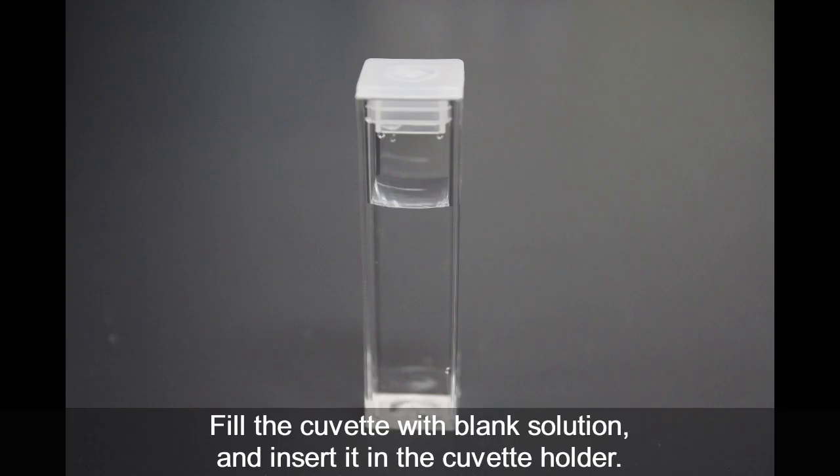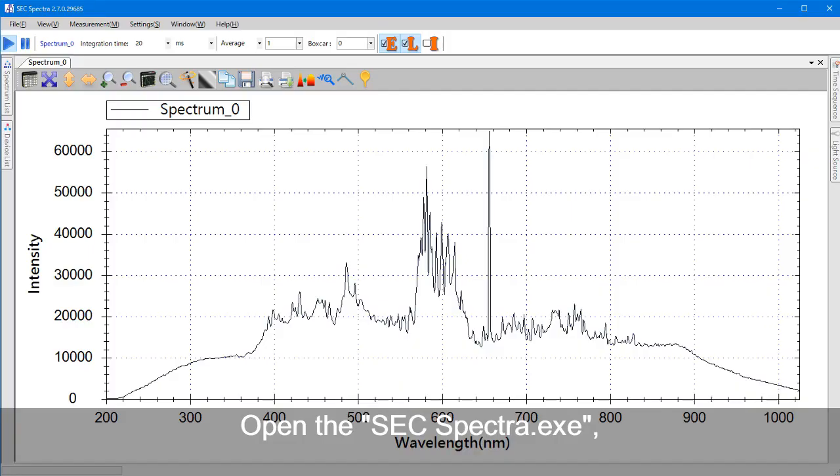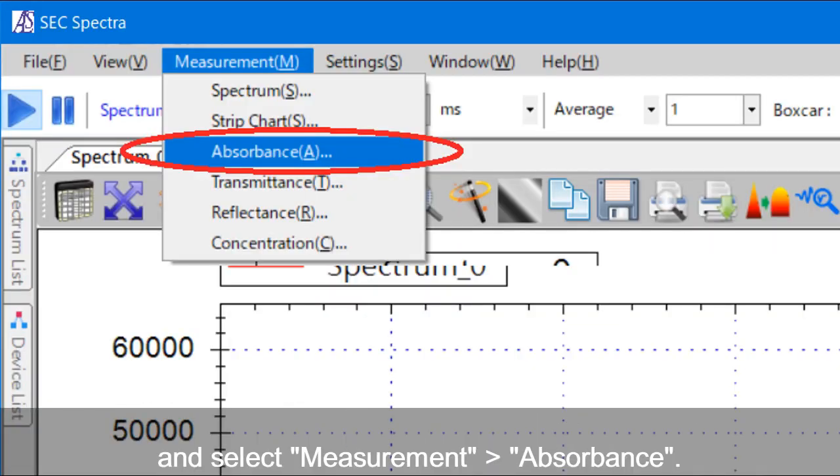Fill the cuvette with blank solution and insert it in the cuvette holder. Open the software SEC Spectra, and select absorbance from the measurement pull-down menu.